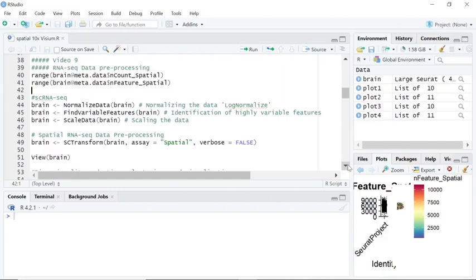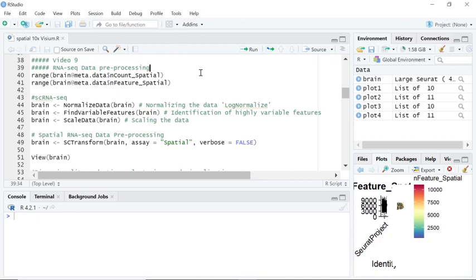Hi everyone, welcome back to my tutorial video series. In my previous video, video 8, we loaded a coronal mouse brain spatial sequencing data into R. We named it as brain.